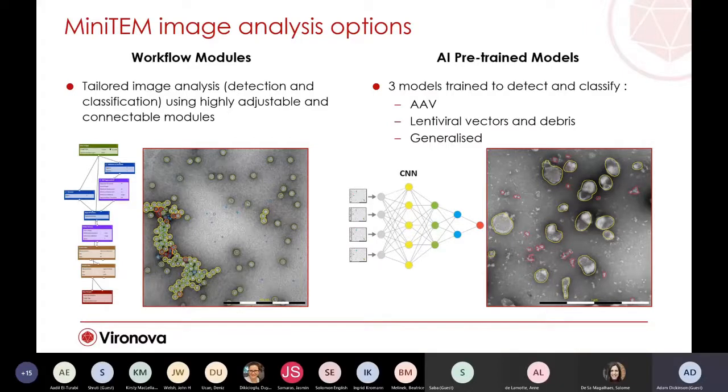Depending on their design, again, they can vary wildly in terms of their size and morphology, and also may present a pleomorphic structure that may be more difficult to detect using our standard workflows. But either way, these can both be used in an automated way to generate quick data. It can take a matter of minutes to process a number of images.